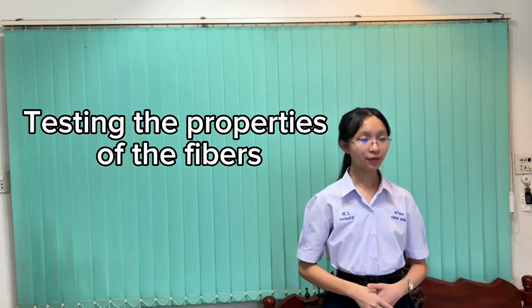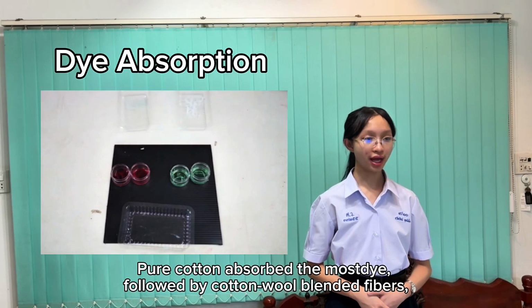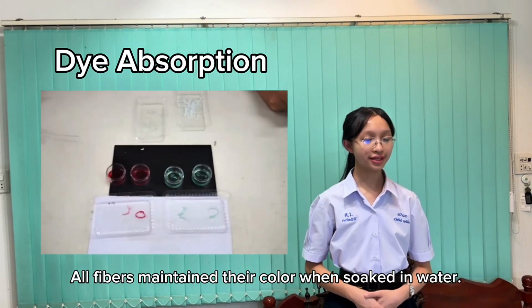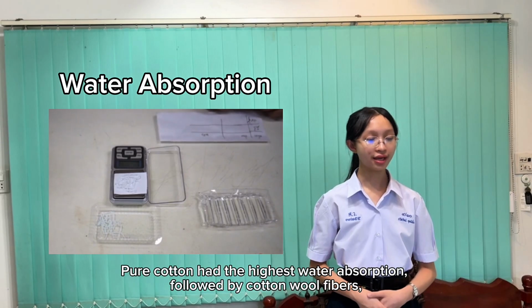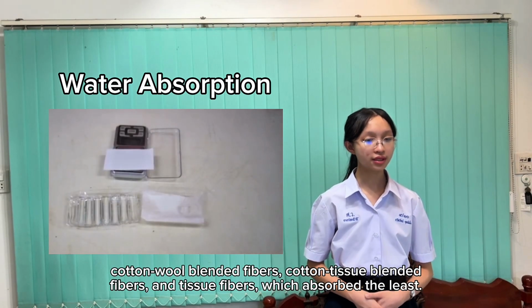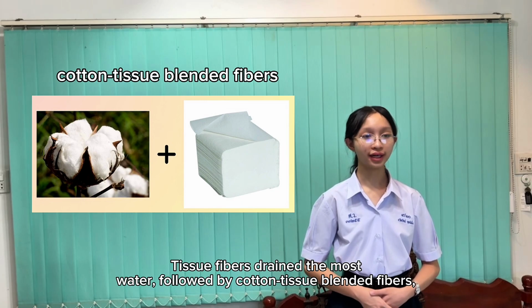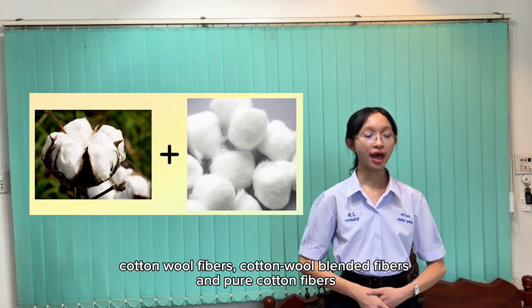Second, testing the properties of the fibers. Dye absorption. Pure cotton absorbs the most dye, followed by cotton wool blend fibers, cotton wool fibers, cotton tissue blend fibers, and tissue fibers. All fibers maintain their color when soaked in water. Water absorption. Pure cotton has the highest water absorption, followed by cotton wool fibers, cotton wool blend fibers, cotton tissue blend fibers, and tissue fibers, which absorb the least. Water drainage. Tissue fibers drain the most water, followed by cotton tissue blended fibers, cotton wool fibers, cotton wool blend fibers, and pure cotton fibers.